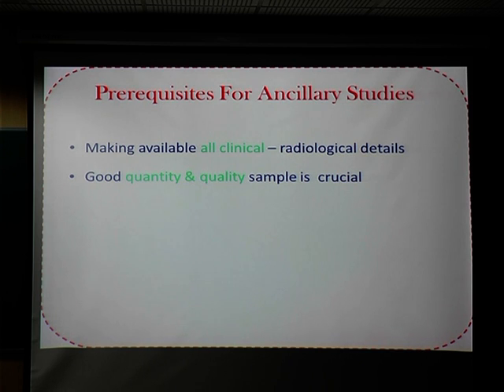Quantity definitely depends on the clinicians. They have to send that sample to us. And many a time they retain a lot of sample and they just send a small penicillin bottle of 5 ml, and 1000 ml of fluid will be remaining in the ward. No, you have to ensure that you get maximum material so that you can also prepare cell blocks from that sediment. Quality, these two points are the responsibilities of the laboratory and the clinician.